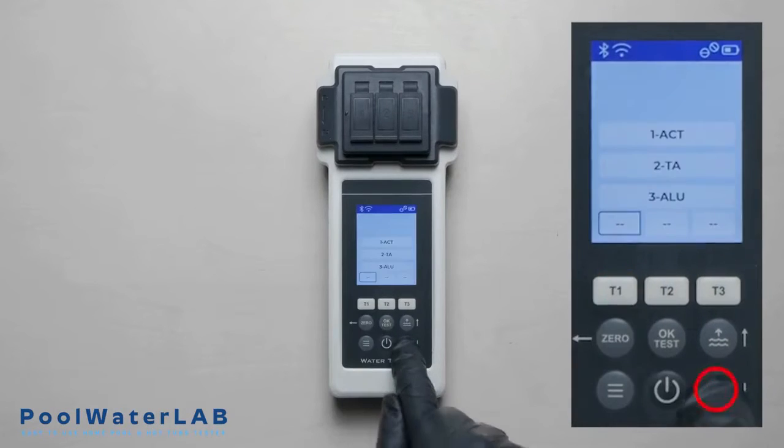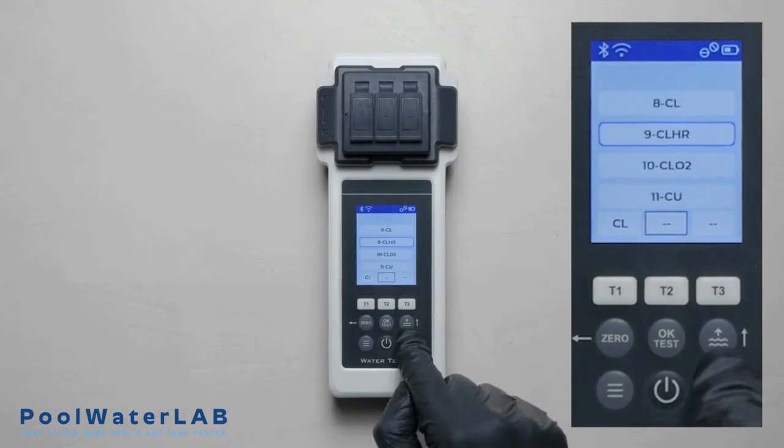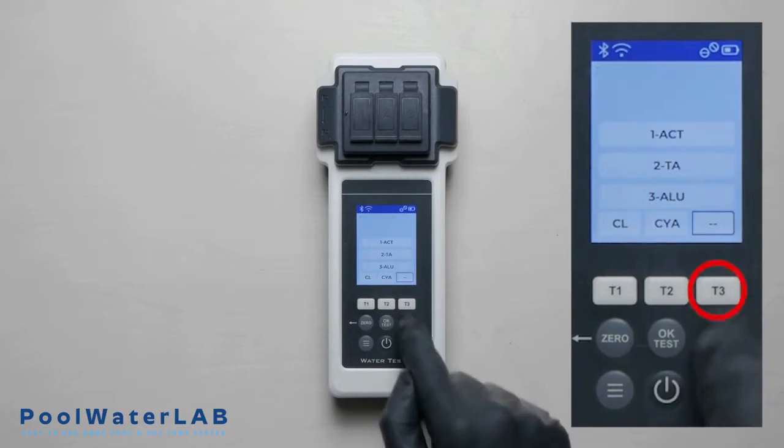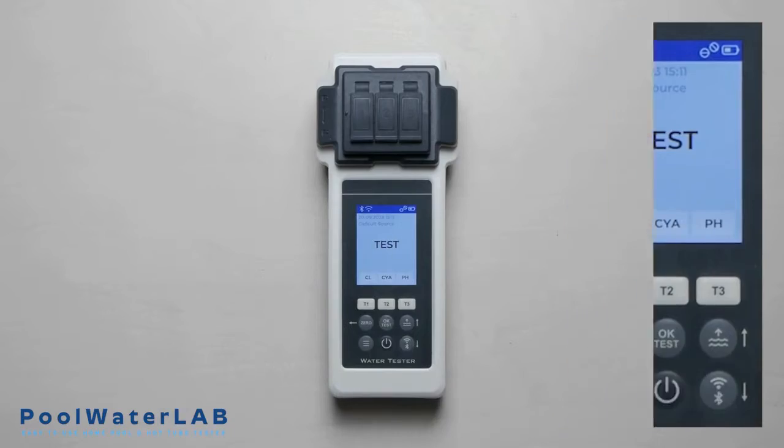Press the T1 button to go to the menu. Use the up and down buttons to select the desired parameter, then press OK. Repeat for T2 and T3. Select the desired parameters for measurements and confirm with the OK button.